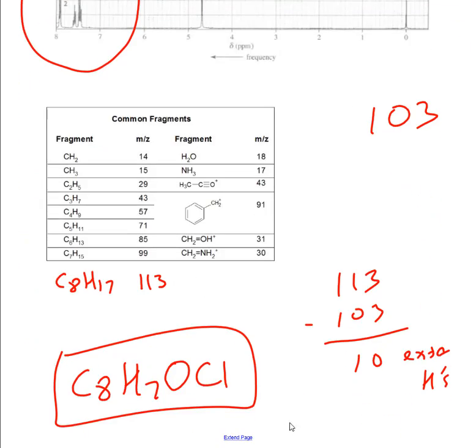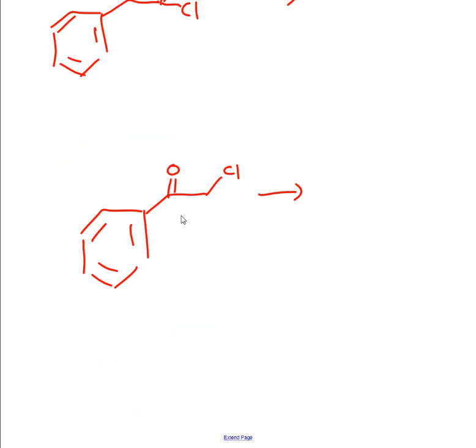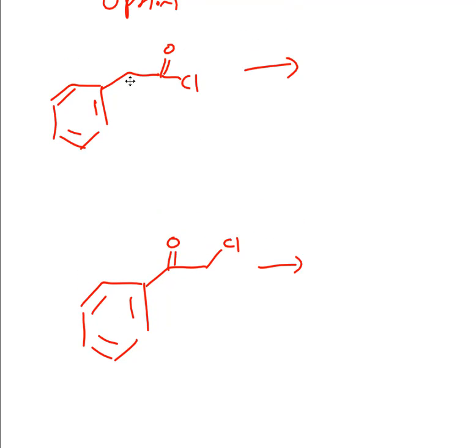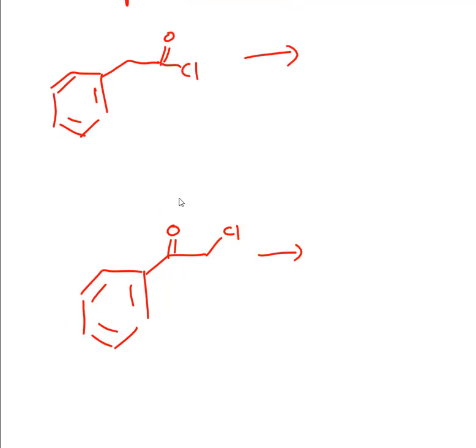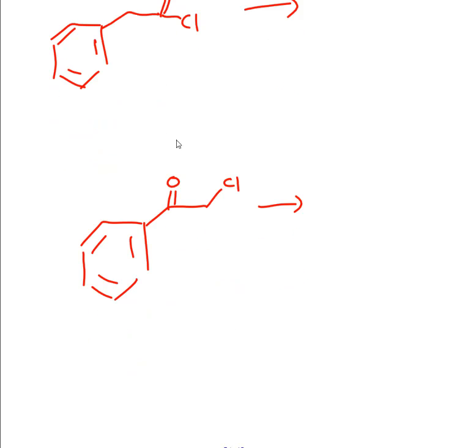Let me pull this down here. This right here. Now, I'm going to show you how to figure this out. The first thing I want to do is this. I want to say to myself, okay, I like this bottom fragment to start with because this is going to be easier to work with. See, well, actually, they're both okay. If I was to fragment this one out, okay, I like this one because it's next to carbonyl. If I was to fragment this out, there's no way. Now, remember, the most important fragment that you get is the triple bond, a carbon that's going to be triple bonded to oxygen, right?